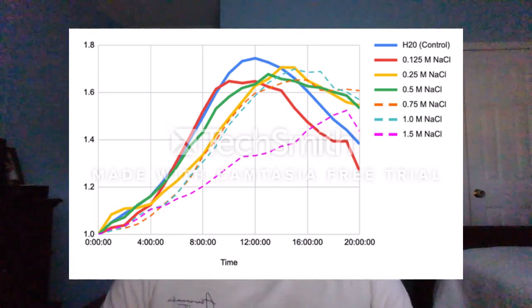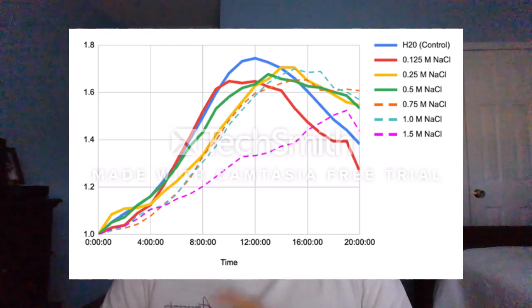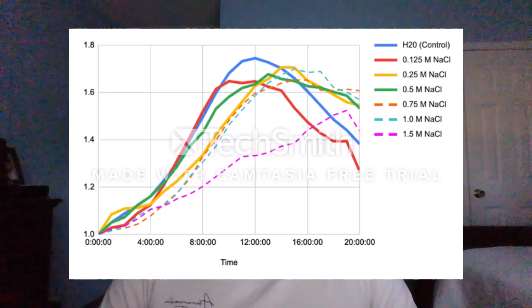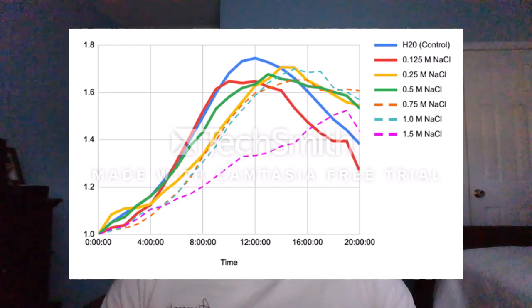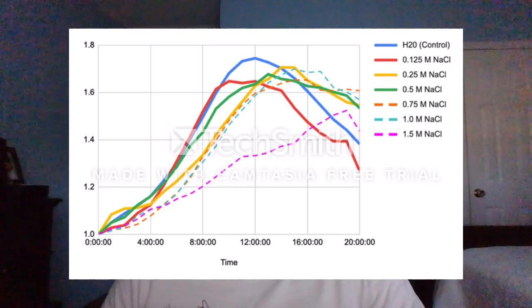Now, based on this graph of all the pairs from the first experiment, it's unexpected that a high concentration of salt, be it the 0.25 or 0.5 or the 1 molarity, provided fewer difficulties for the microbes to grow. The microbes grew noticeably more than in those lower concentrations, despite the idea that harsher environments equal more difficulties to grow.